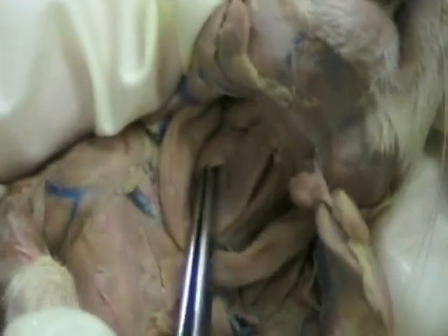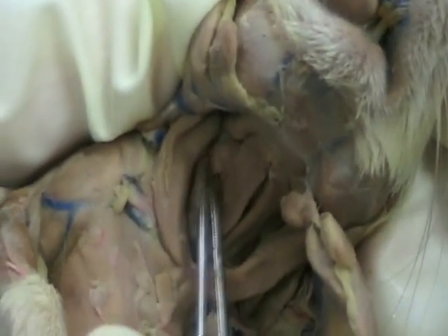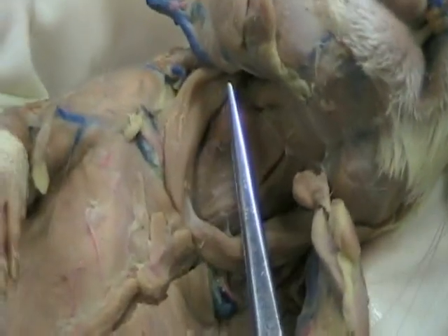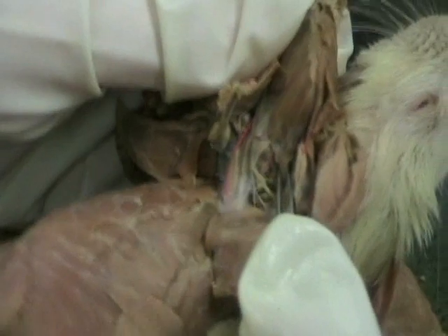Now going the opposite way of the V's, you see one going to the hyoid, going from the shoulder. So from the shoulder to the hyoid, we call that omohyoid. And that's this one right here. You can see it on the other side pretty good too, I saw. Can we? Yeah, there it is. Right here, this one. That's the omohyoid. And when we do the muscles back here, when we find this one right here, that's omohyoid. And you'll see that when we pull on it, we've got the right muscle.